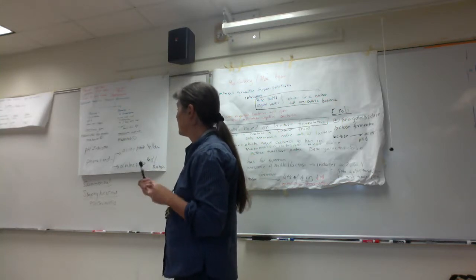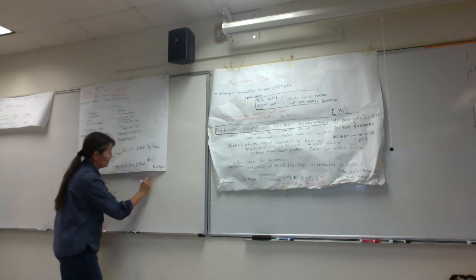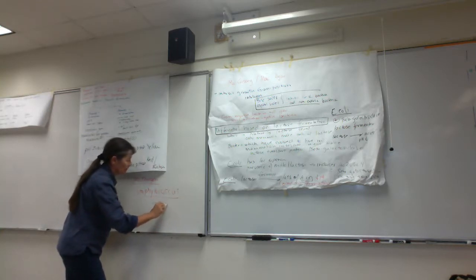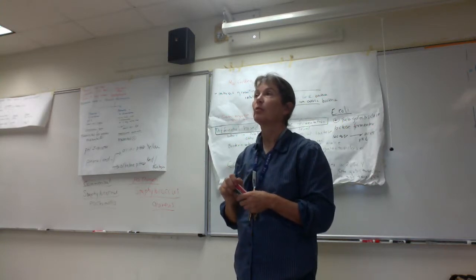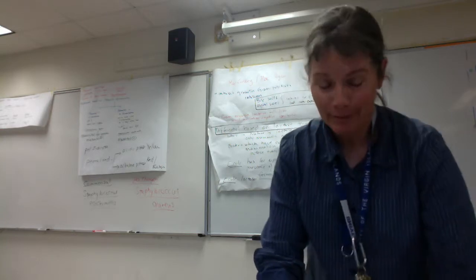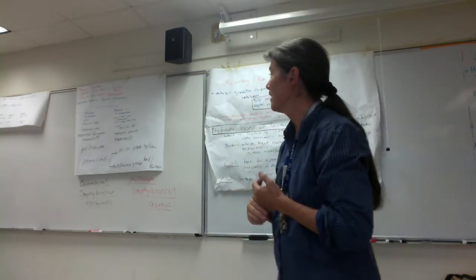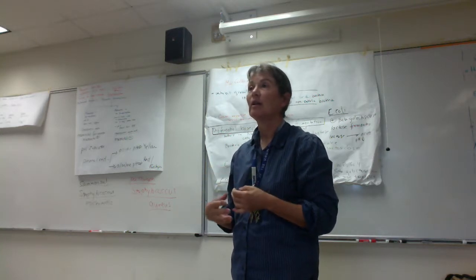But then in contrast, there's its cousin, and I'm going to label it as a pathogen because it's so much more aggressive. Staphylococcus aureus. Aureus comes from the fact that on certain types of media, it will form golden, yellow colonies. And folks, we are worried about Staphylococcus aureus because it's a really efficient tissue invader. And we'll see when we get to the medical micro unit in lecture, it has so many what we call virulence factors. I'm sorry, I just realized I didn't plug in the microphone. Apologies. I'm hoping the internal mic might have picked up some of this. Okay. So again, folks, we're talking about mannitol salt agar, and two species of the genus Staphylococcus, Staphylococcus epidermidis, that can live as a commensal on our skin, and the more virulent Staphylococcus aureus.